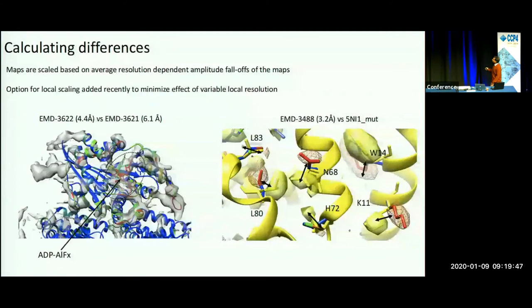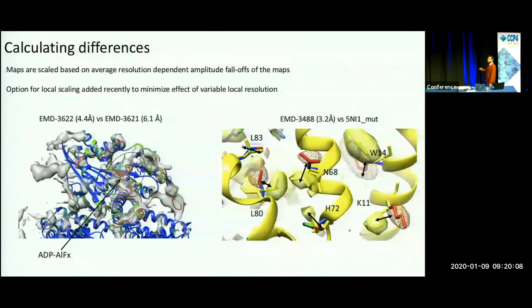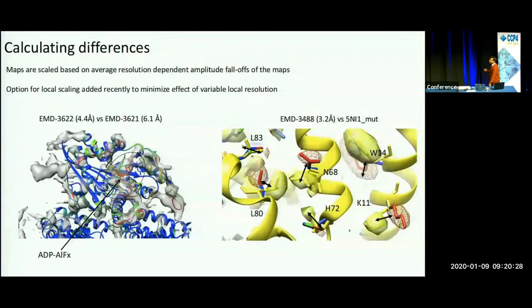Here are two examples of map-versus-map comparison. A map of kinesin bound to ATP analog — ATP aluminum fluoride — and another map in a non-ligand state. Calculating the difference between the two, we hope to see major conformational changes plus the ligand binding site. The gray density is the difference map, which identifies the ligand binding site plus parts of the kinesin that are stabilized upon complexation with the ligand. You can also identify conformational differences by calculating the difference maps.